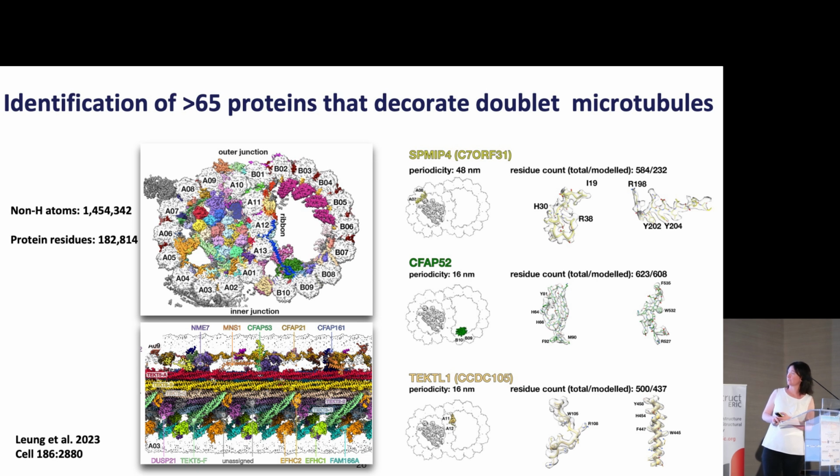So what we're going to do next, and the white are the microtubules that are the scaffold, if you want. And this is the cartoon presentation of this model. And then we can remove the microtubules, so you can see how this structure is all interconnected between the different proteins.